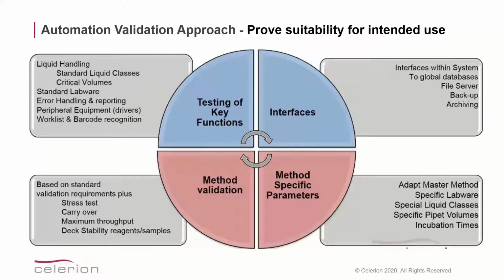She will proceed with a description of the data flow within our facility and describe the maintenance and control aspects, including the proper documentation in our electronic lab notes. And in addition to that, Rebecca will outline the process of robotic method development from request to final approval of the qualified method.